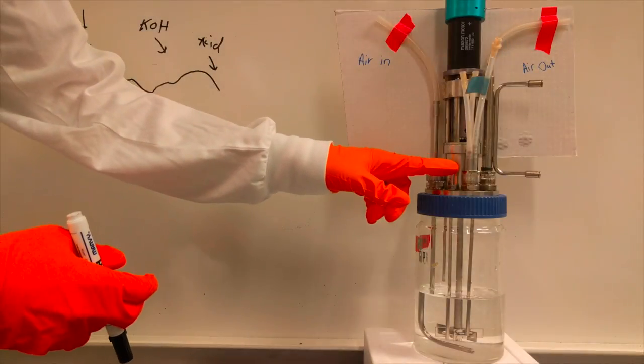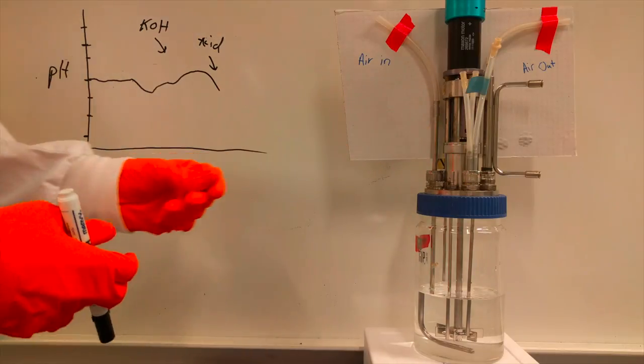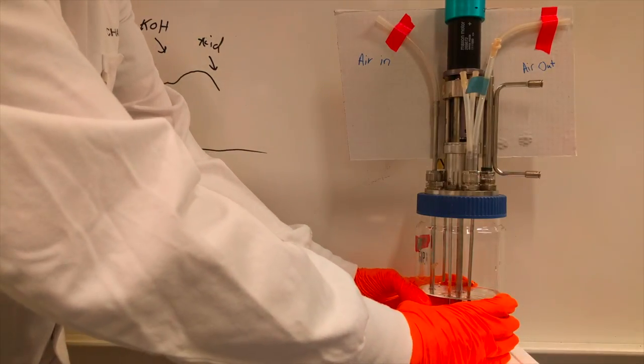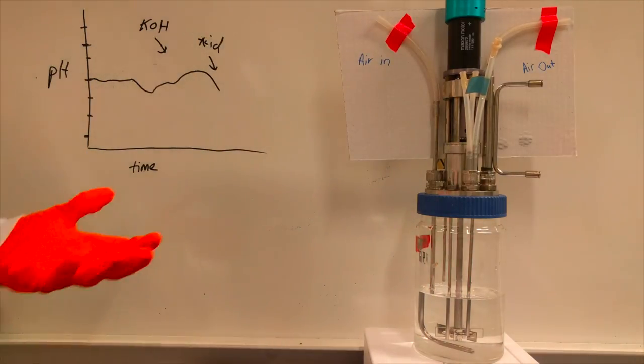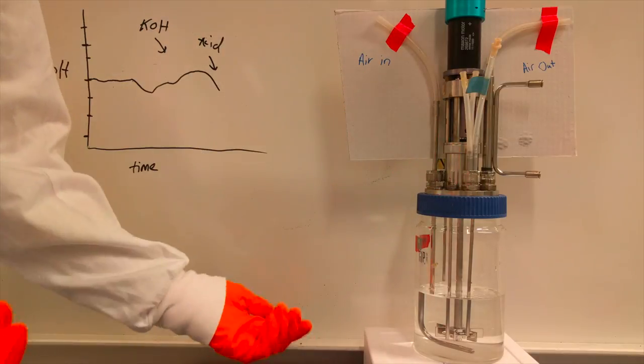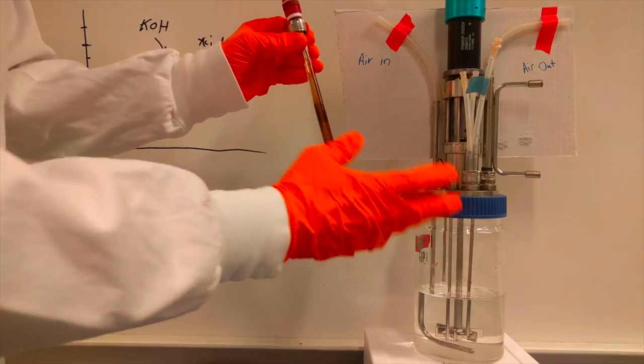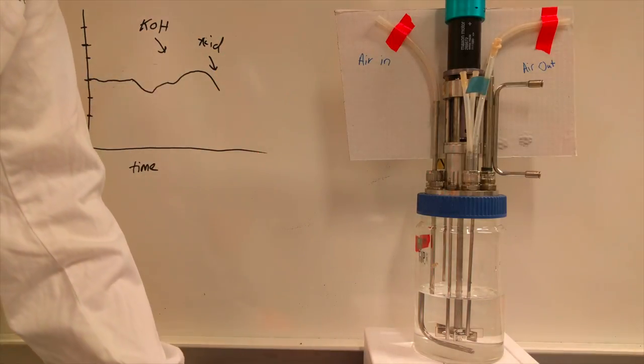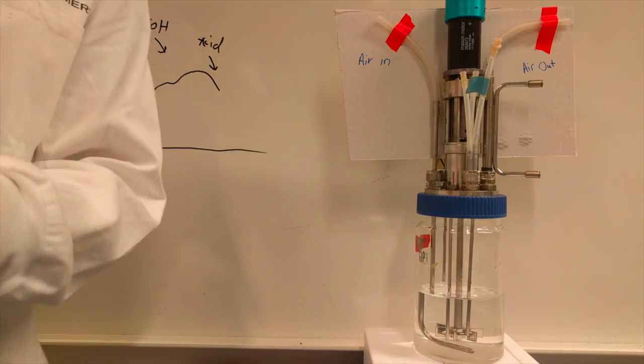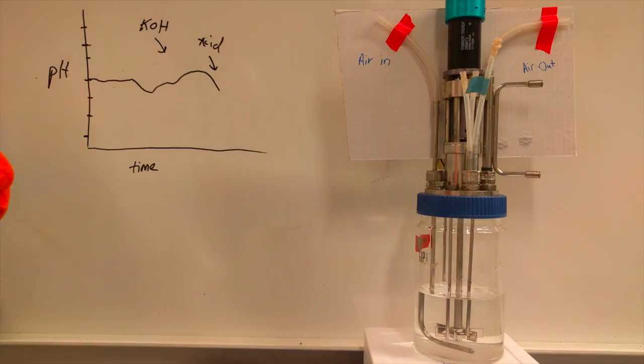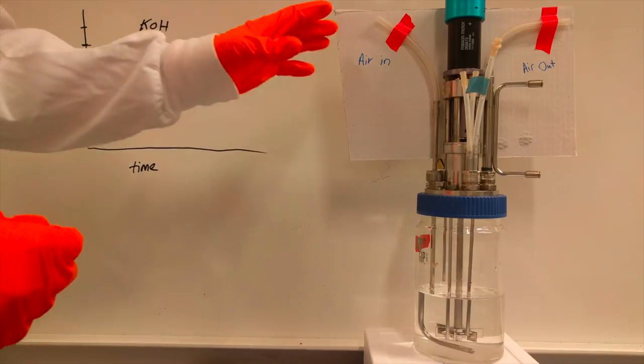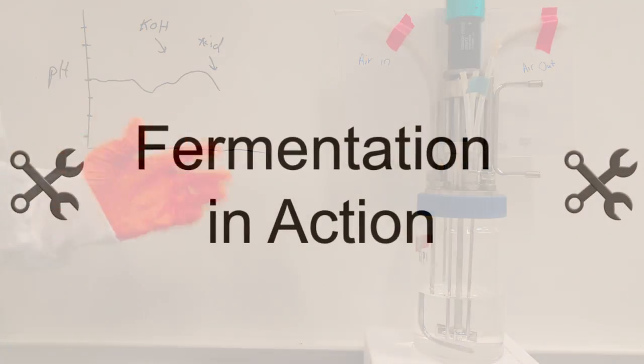One last thing to mention is this port that I showed you that we'd hook a digital thermometer to. That's going to allow us to track the temperature. This particular type of fermenter is going to be sitting in a chamber which is going to hug it on all sides, and that's actually going to provide heating to the vessel. Other systems might have what's called a heat finger, which basically just looks a little bit like this pH probe, but it will be metal, and it will heat below the surface of the liquid to keep the heat constant. So all in all, this fermenter is going to allow us to control a lot of variables. I'm going to show you now what it looks like when it's actually running. If the next step gets too complicated, you can always come back.